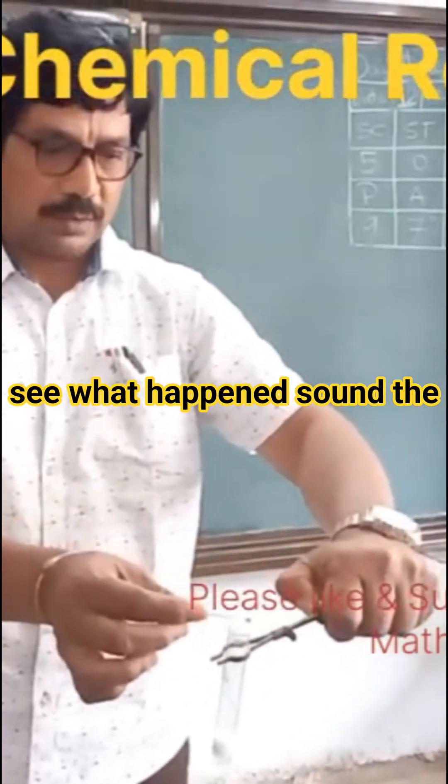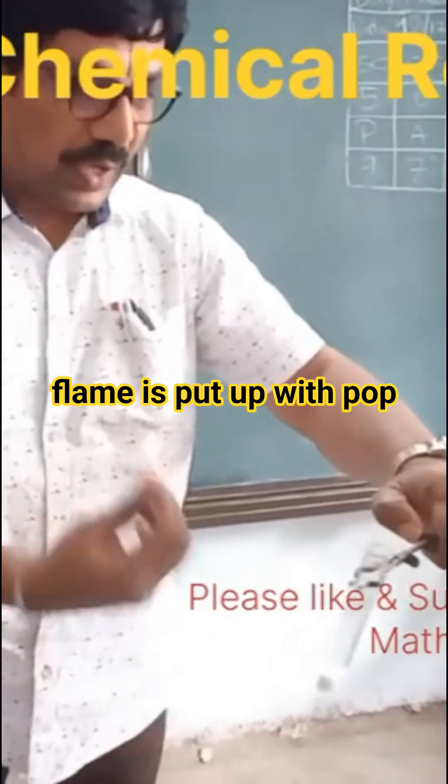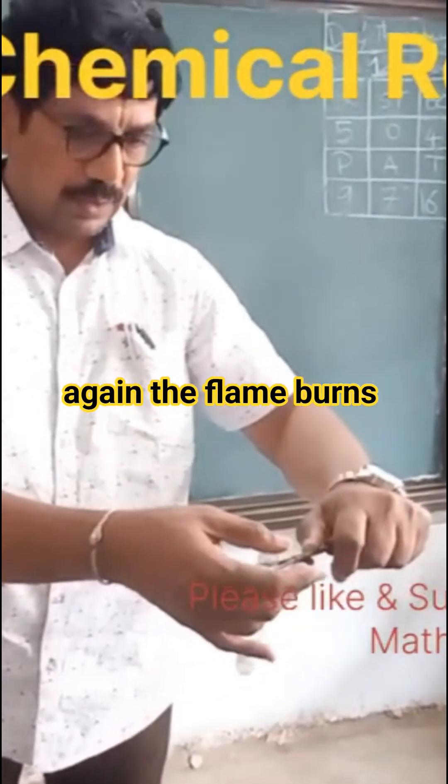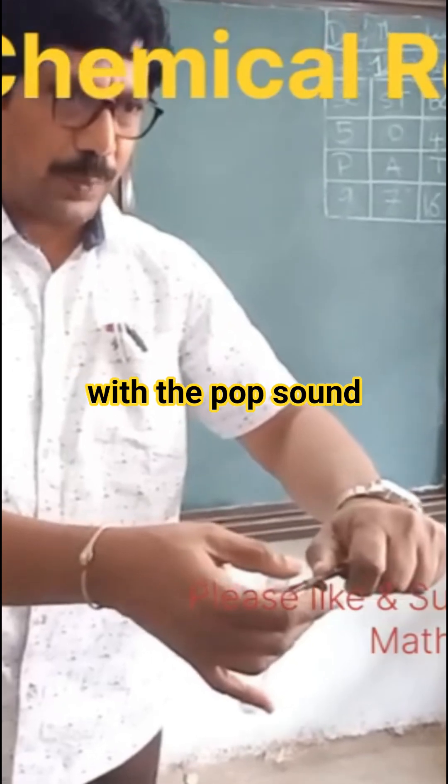What happened? The flame is put off with the pop sound. The flame is once again lit. The flame is put off with the pop sound.